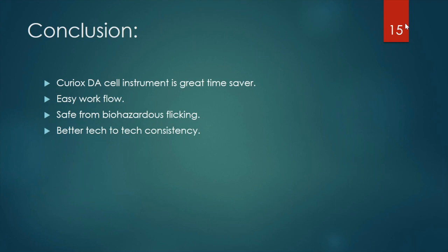But does it affect your cross-match protocol for your antibodies and for your concentration? That may differ from your protocol to my protocol. But I would suggest that you have a protocol where you don't have to remove the residual volume.